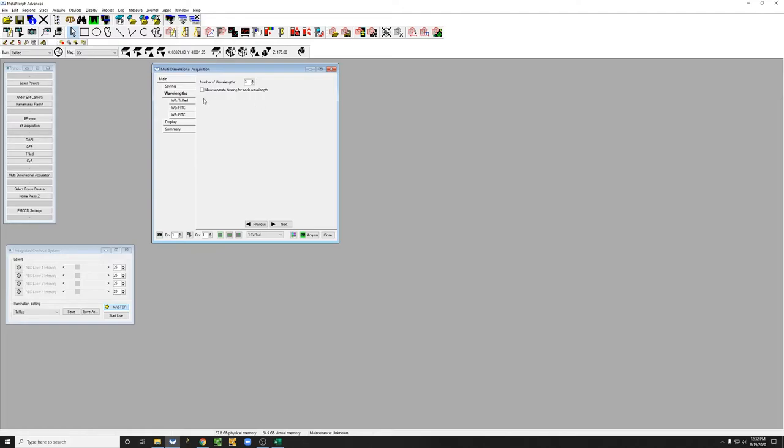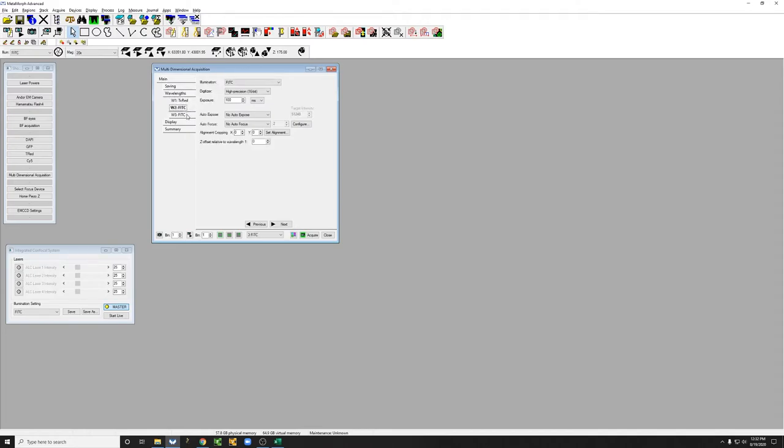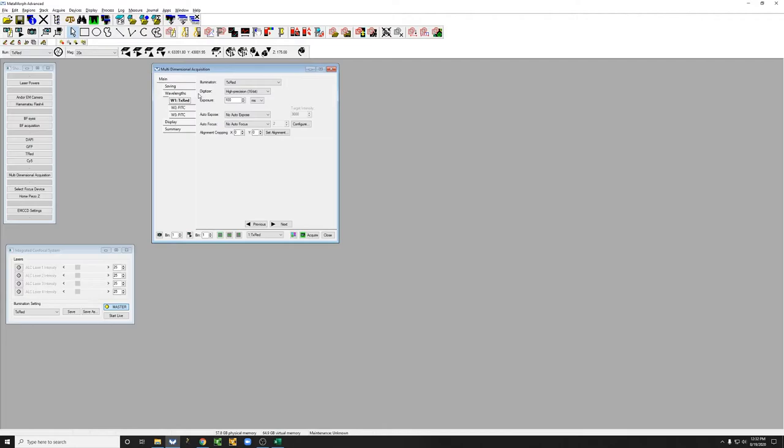So now you can see that there are three subtabs here. Each of these subtabs contains the settings for one of the channels, and so one of the first things we need to do is to decide which order we want to acquire the channels in.